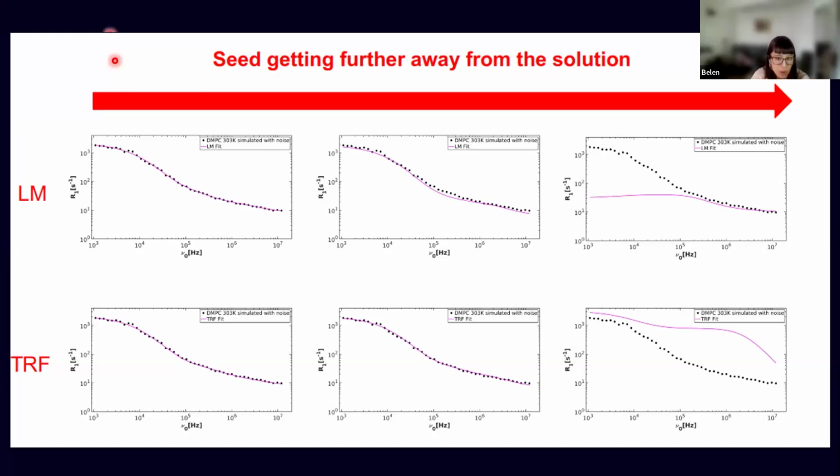And given the complexity of our model functional form, we couldn't rely on a gradient-based method like Levenberg-Marquardt or anything similar. So we turned to derivative-free methods. First we implemented a global minimizer called DIRMIN, which is an adaptation of the well-known DIRECT method.